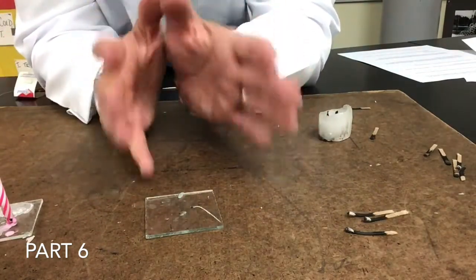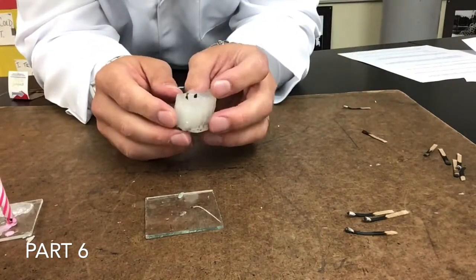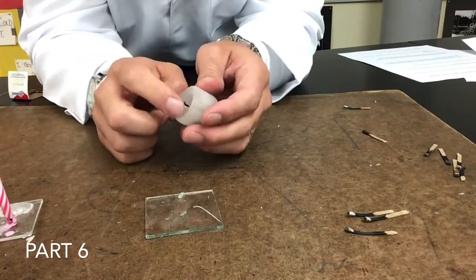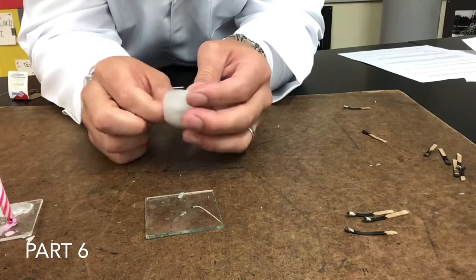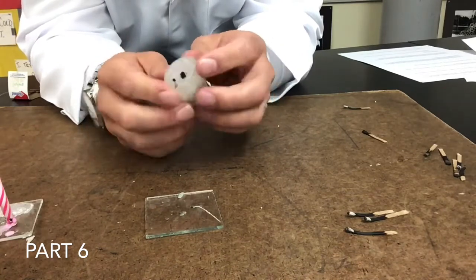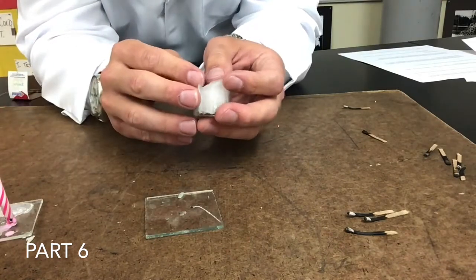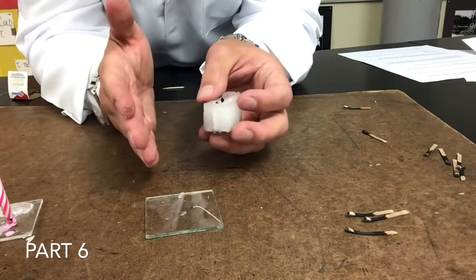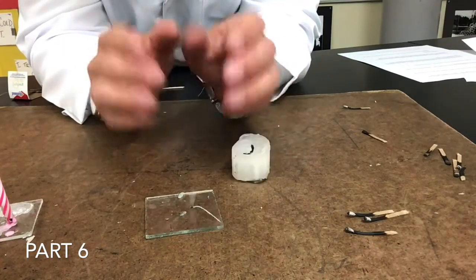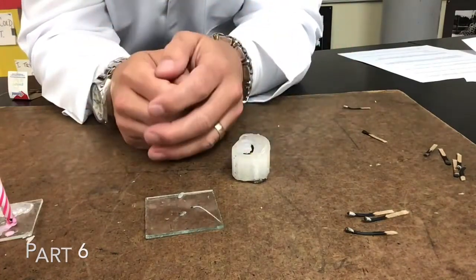I wonder if there's a reason for that. In fact, if you think about the word wick, right? Anything that is wicking means like absorbing. So I wonder if there's something to do with this traditional wick inside the candle that absorbed something so that it slows down the burning process. Something interesting to think about. But as far as part 6 is concerned with the string, go ahead and pause this and write down your observations of what you thought. Remember to write clearly and concisely so everyone can understand what you're talking about.